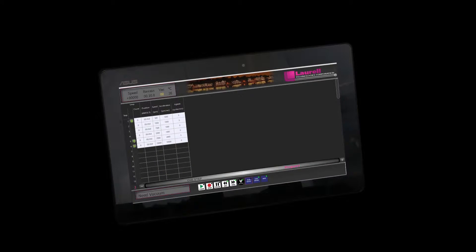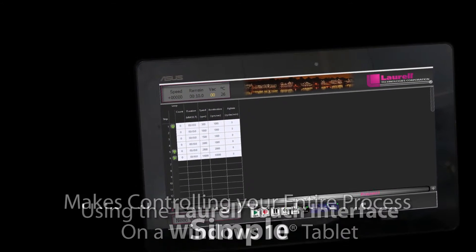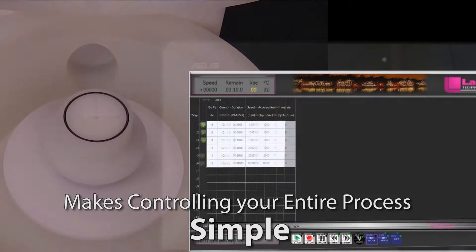Using the Laurel Touch interface on a Windows 10 tablet makes controlling your entire process simple.